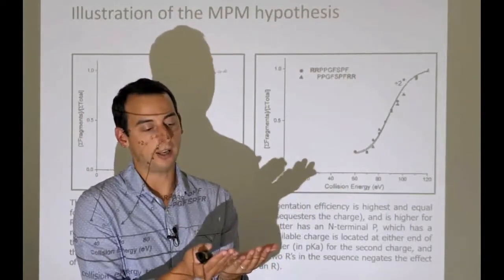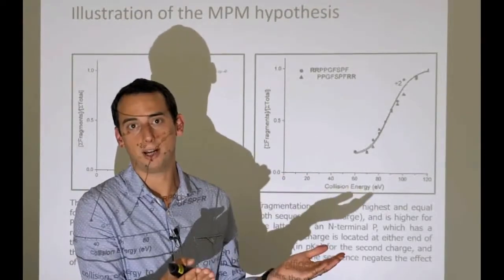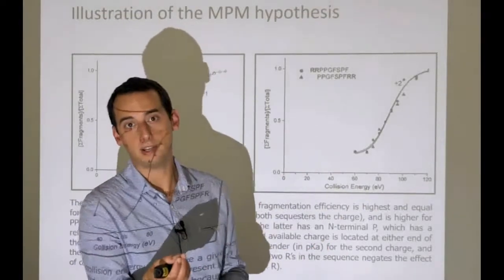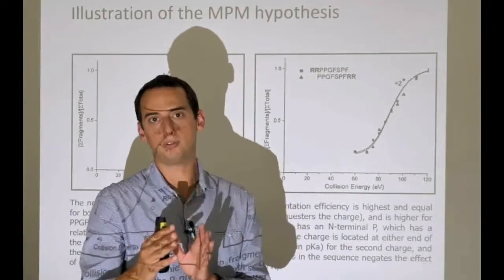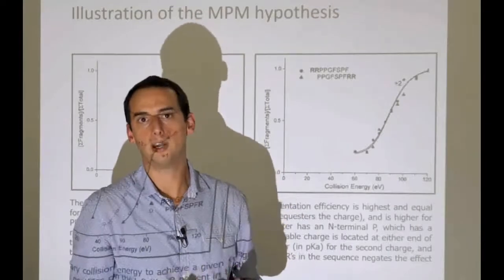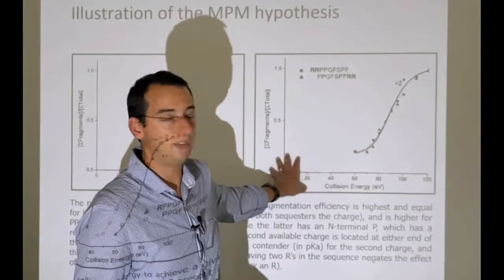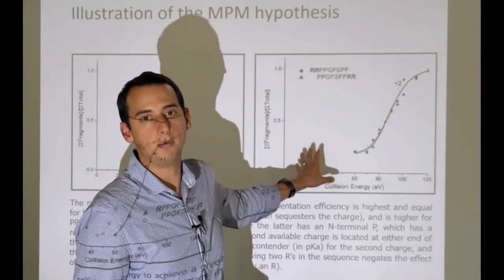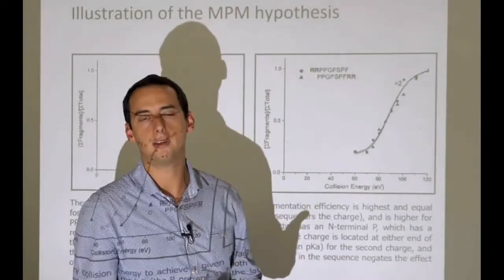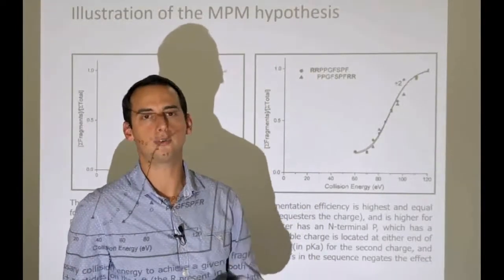You can also look at a lysine at the C-terminus. We should see more B ions and a better spread of Y ions. If we see an arginine at the C-terminus, we can say, we would expect a lot of Y ions, especially the ones close to the arginine, and so forth. So this can help you interpret things if you understand this. And if you have a basic notion of this and of the pKa's and the pKb's, you should be able, with a few example data sets, to quickly learn what kind of spectra you're supposed to see for certain analytes.